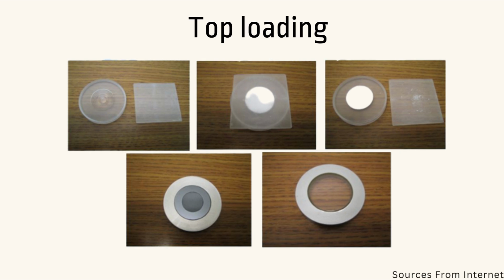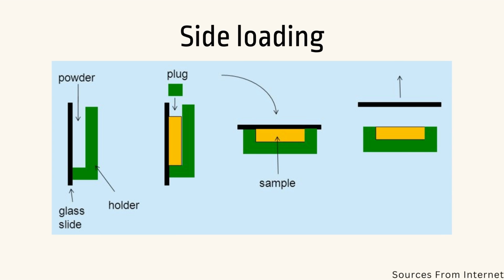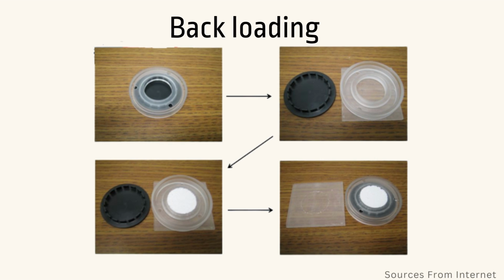How to load the sample to the sample holder. The sample can be loaded by using top loading, side loading, and back loading.